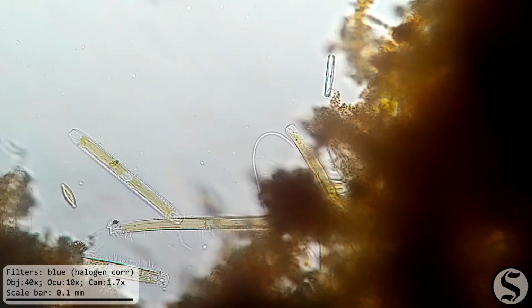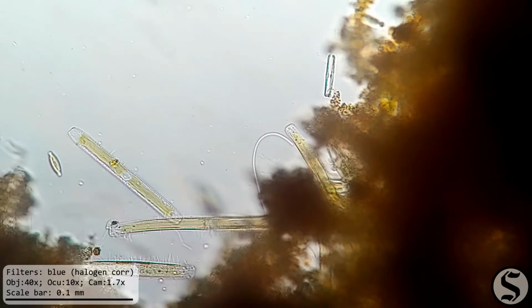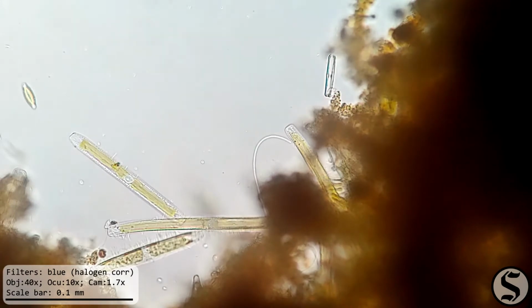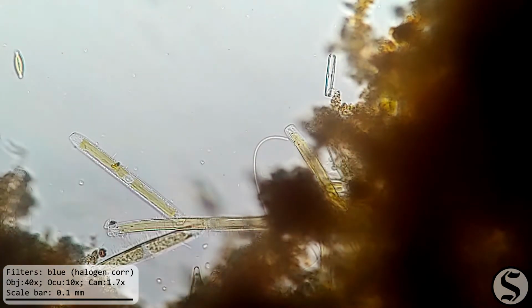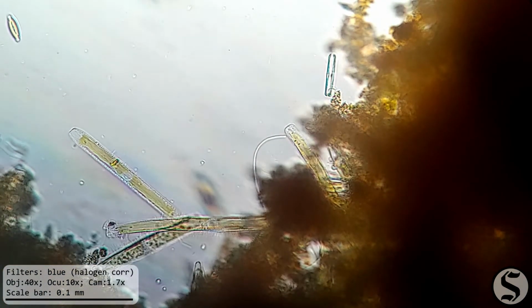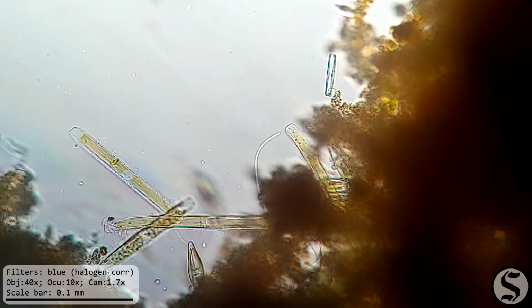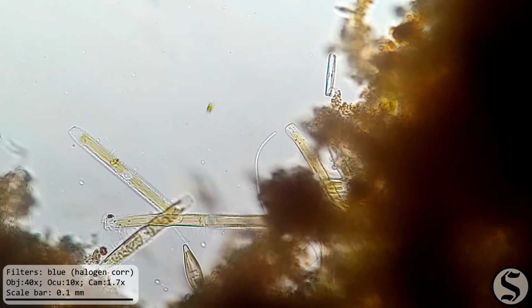Those diatoms near it are of the genus Nitzschia, and they're named after the person who discovered them, a German naturalist named Nitsch. And you can also see that some of those nearby diatoms are covered in growths of bacteria. Interesting.